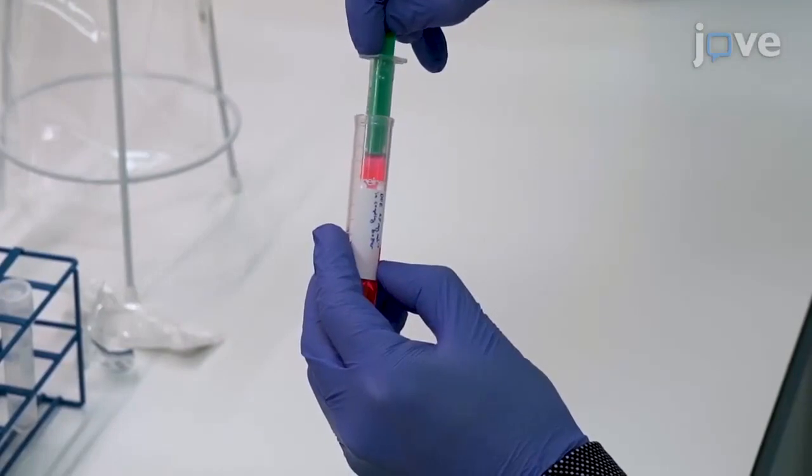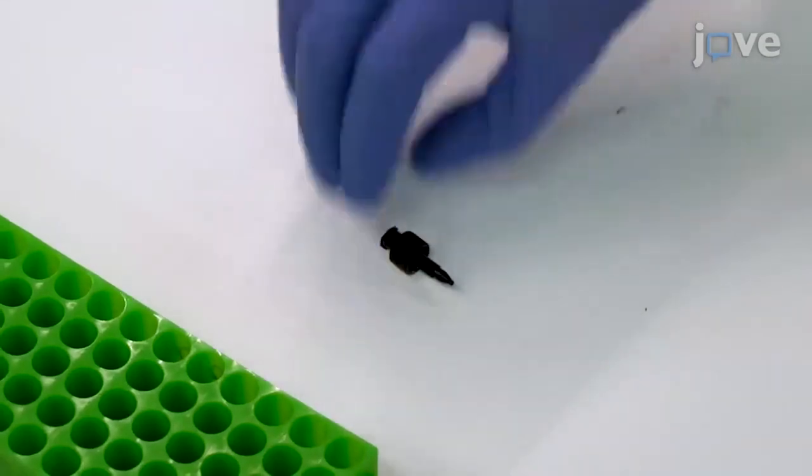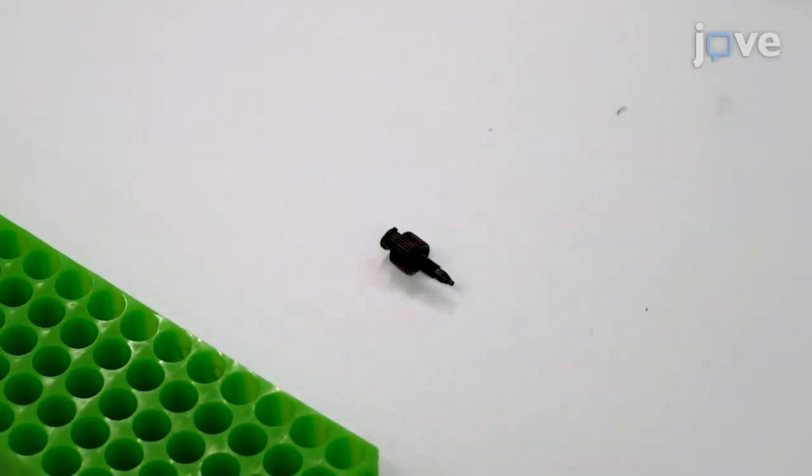Next, fill one 2 milliliter syringe with the DFE solution and prepare an adapter to mount the syringes on NHS activated cross-linked agarose columns with a bed volume of 1 milliliter.